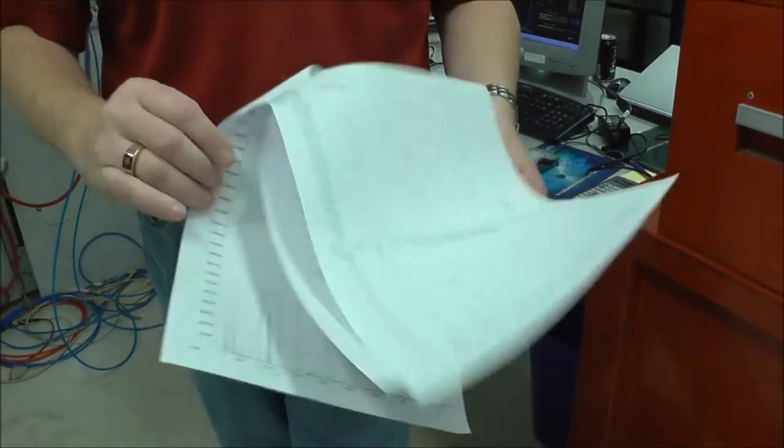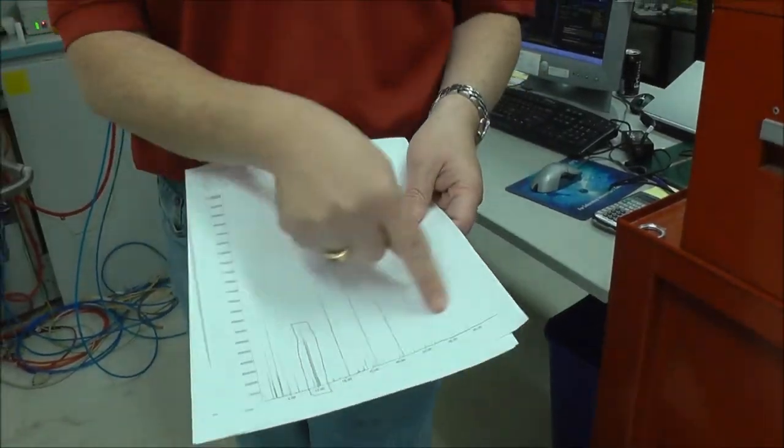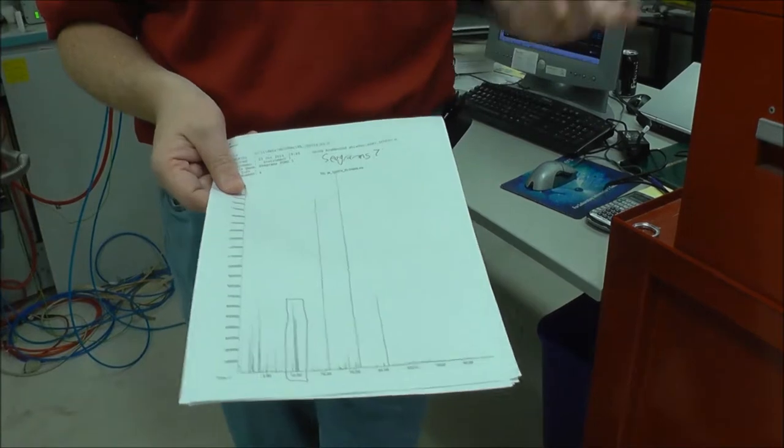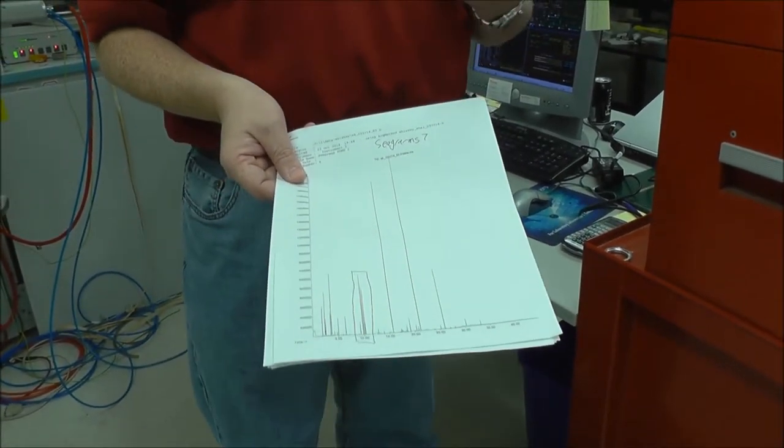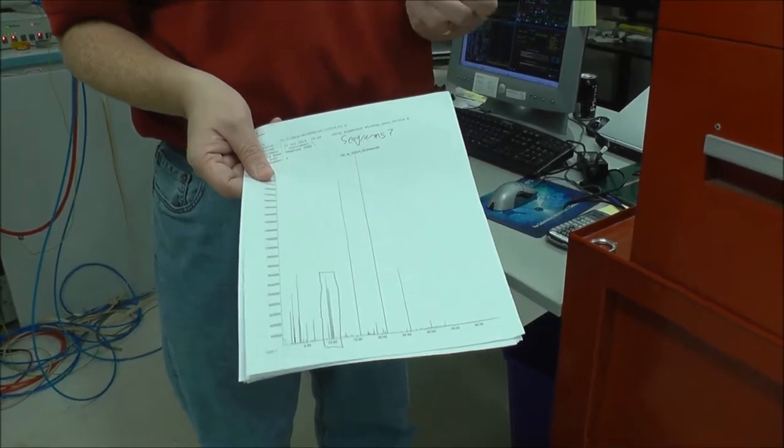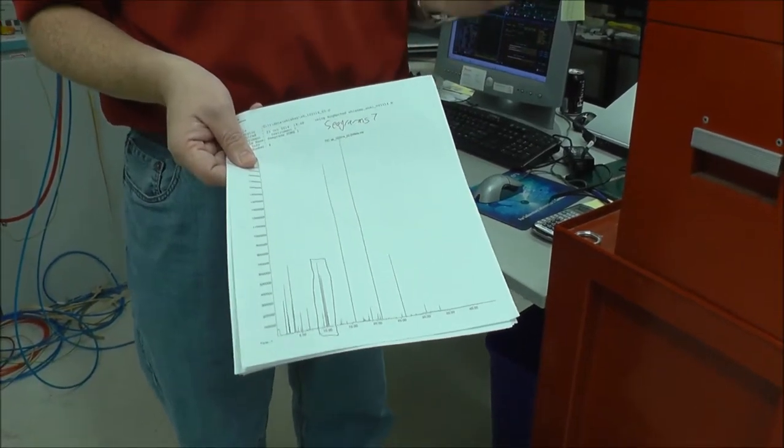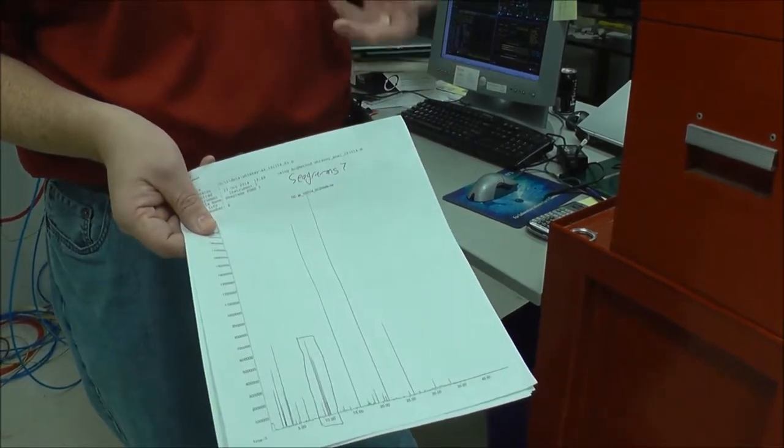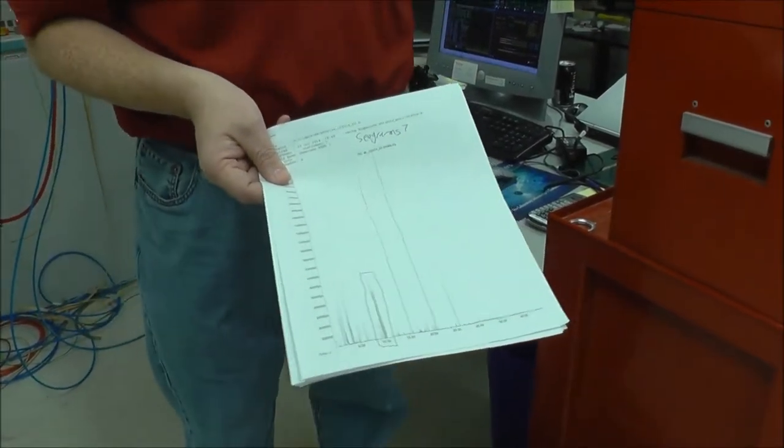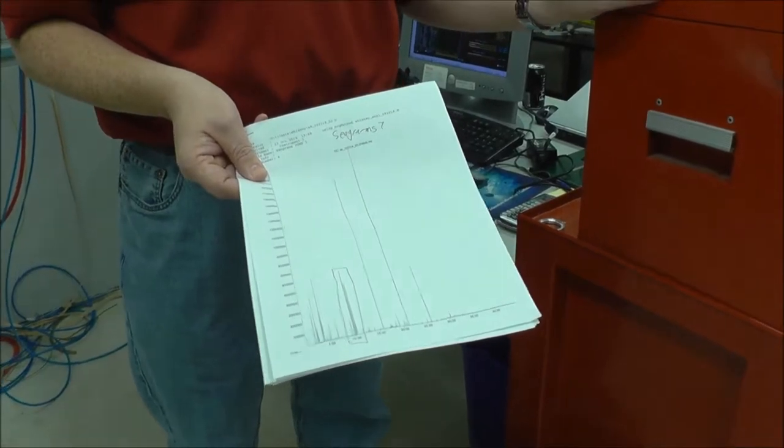And so you could envision then for almost every one of these peaks, we would have a list of components. And so what Cardinal will do when they begin to make their whiskey, will be to determine what kind of barrels they're going to use, how they're going to fire them, what the grain bill is in the whiskey, in the raw mash before they distill it. And that will help them figure out how they want to make their whiskey.